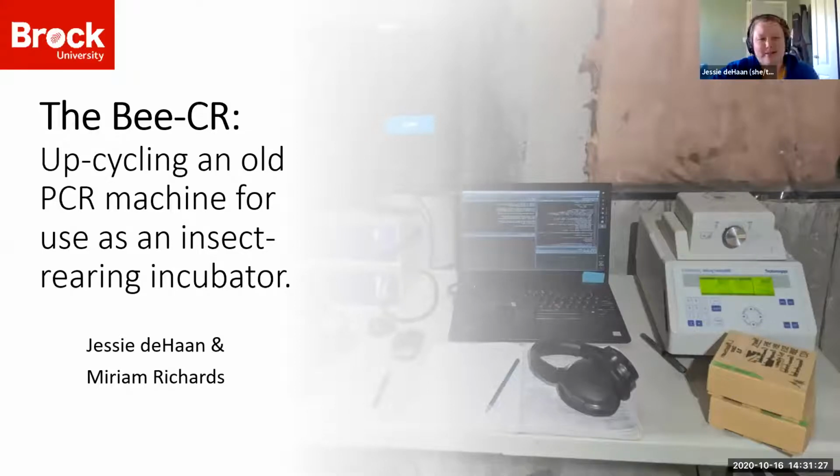Today I'm going to talk about how we came to discover that we could use an old PCR machine to rear my study organism, Ceratina calcarata.